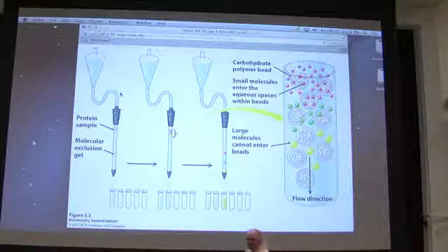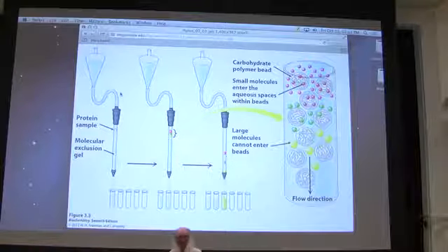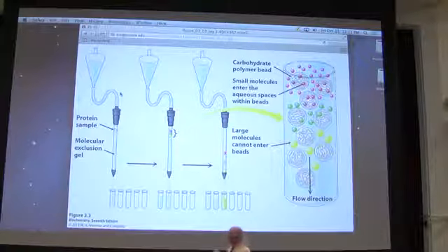Question? Those beads are in a fixed position. They're not flowing. The beads are in a fixed position. That's correct. Okay? The beads are in a fixed position. So buffer is flowing through them. It's flowing through the column.